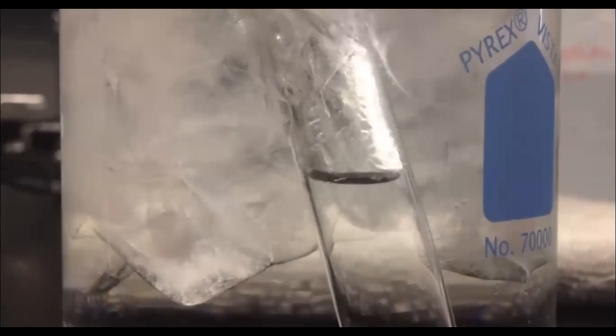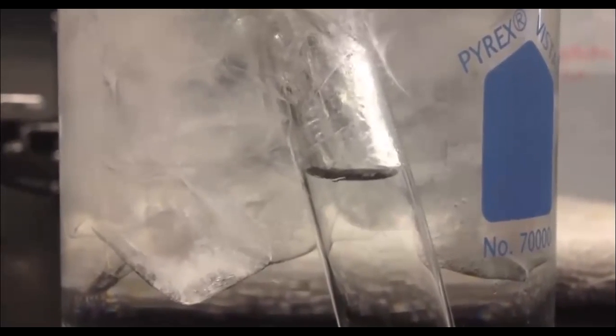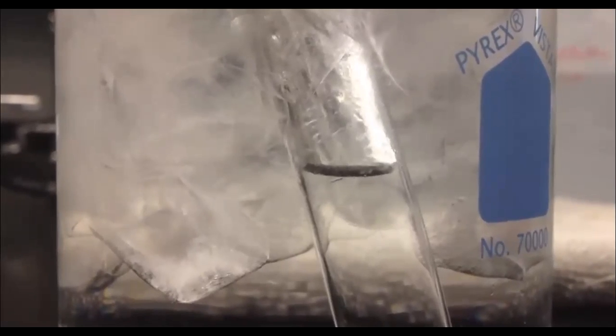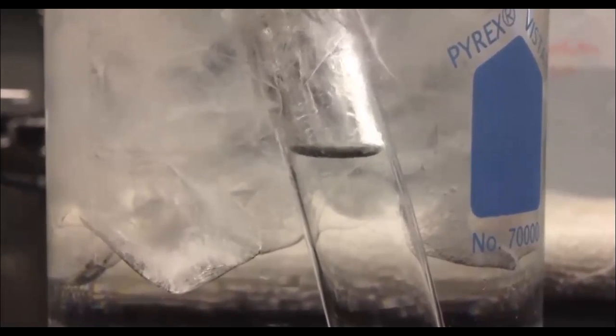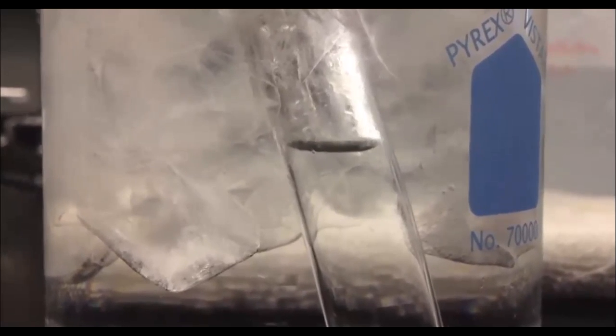You can see I'm kind of zooming in on the test tube inside the beaker, that you can see that the level is rising. I'm collecting distilled water as it boils here, slowly but fast enough that you can observe it happening here, and we're condensing the steam into water here in the ice water bath.